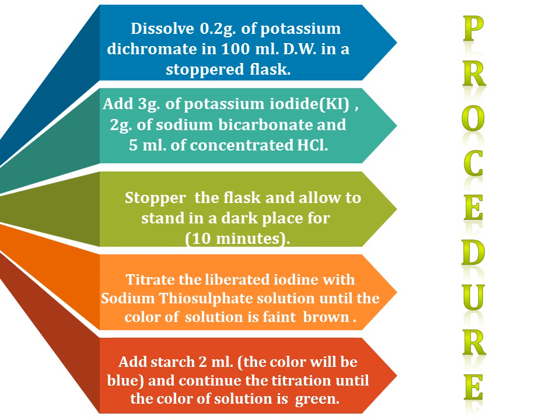So, the remaining amount of potassium iodide will solubilize the produced iodine. راح يتحول من water insoluble iodine to water soluble potassium triiodide. يعني معناته البوتاسيوم ايودايد راح ينقسم إلى جزئين. جزء منه يتفاعل مع البوتاسيوم دايكروميت ويحرر لي اليود، والجزء المتبقي to solubilize the produced iodine يحوله من water insoluble إلى water soluble potassium triiodide. الإضافة اللي بعدها حتكون 2 gram of sodium bicarbonate to prevent the precipitation of sulfur by making the pH of solution alkaline.